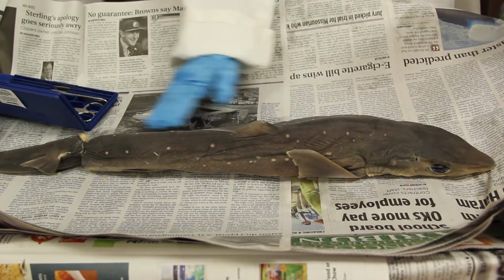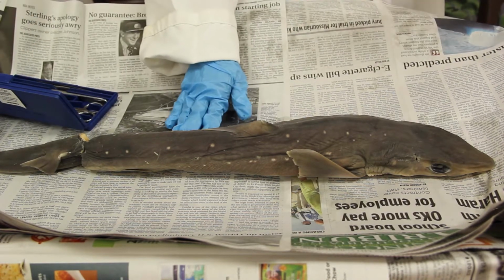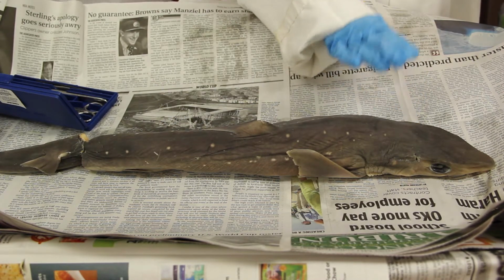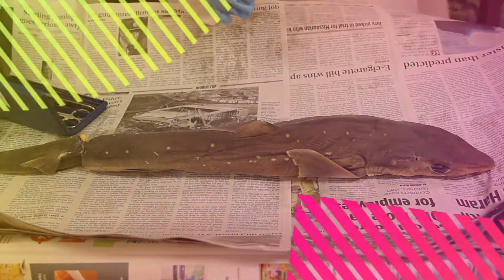There's a tail projecting beyond the anus at some stage of development, and there are also pharyngeal pouches present at some stage of development. It has a ventral heart with dorsal and ventral blood vessels, and it's a closed blood system, and they're also equipped with a complete digestive system.